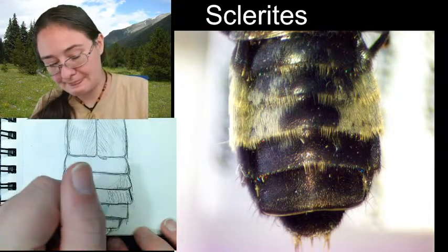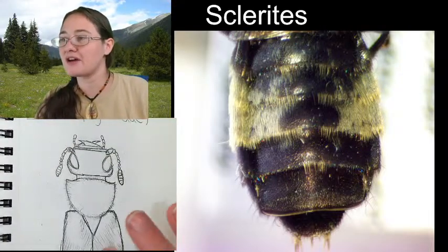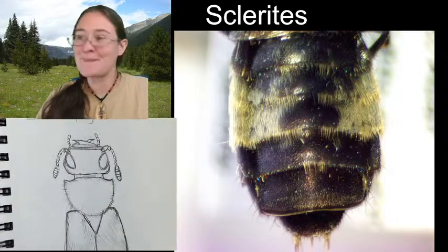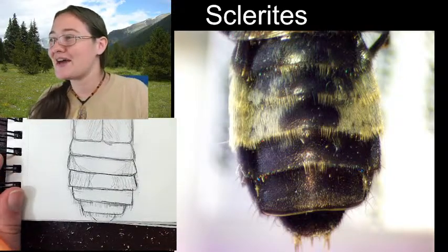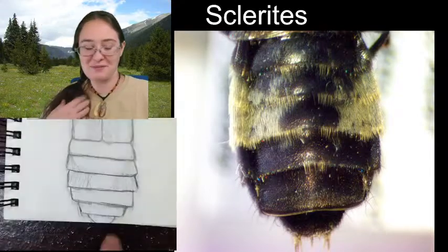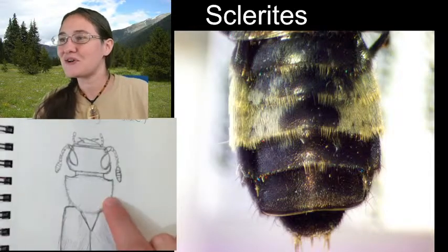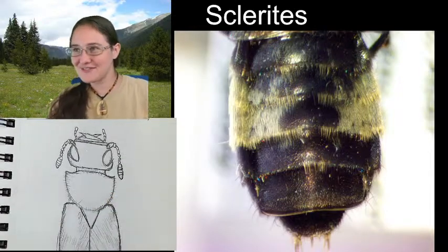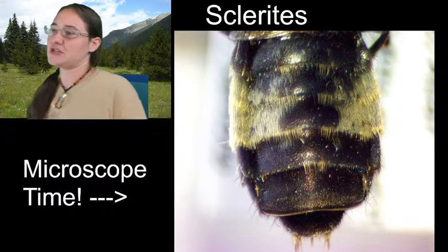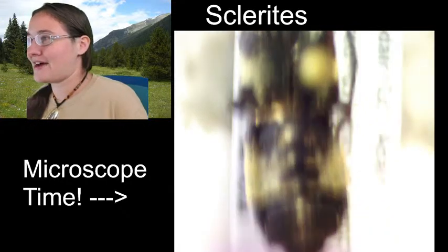All right. So it looks like we've got our hair taken care of on our abdomen. We have our elytra, the scutellum, the pronotum, all of those head features. We are making it somewhere, guys. If you want, I could zoom in on the end of that abdomen, but I don't have the ability to sketch the end. So what I'm going to do is focus on a leg, because we haven't looked at any of these legs yet, and I would really like to see if there are any fun features that we can talk about there. Let's go ahead and check that out.